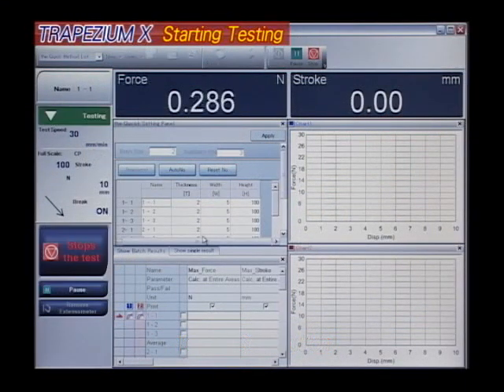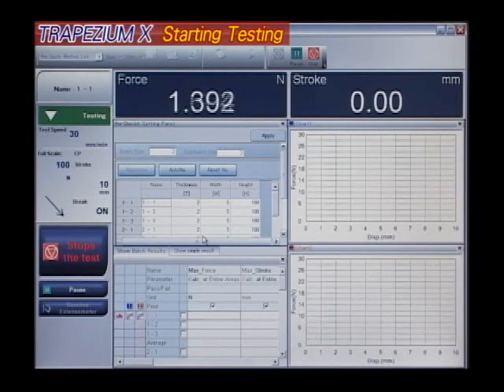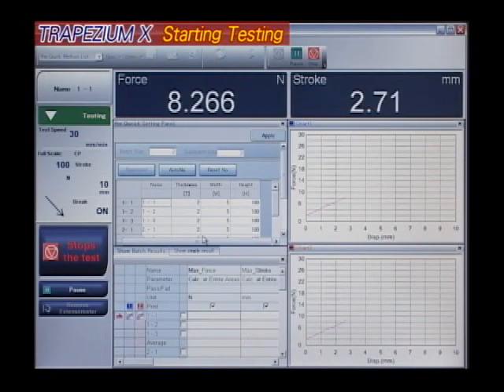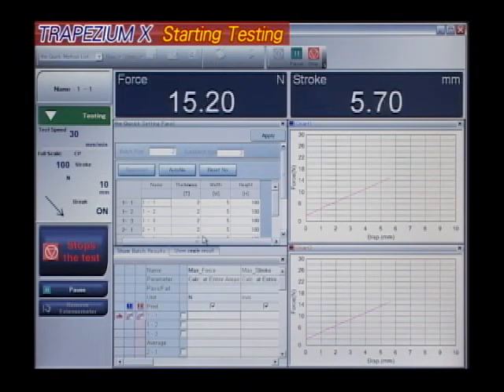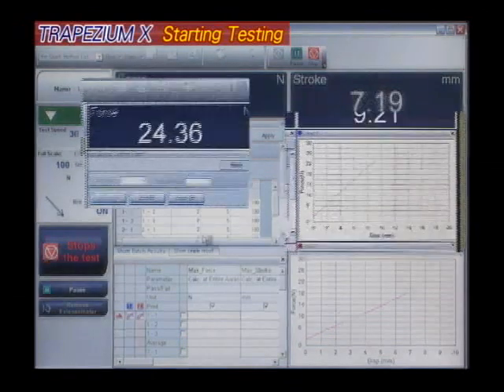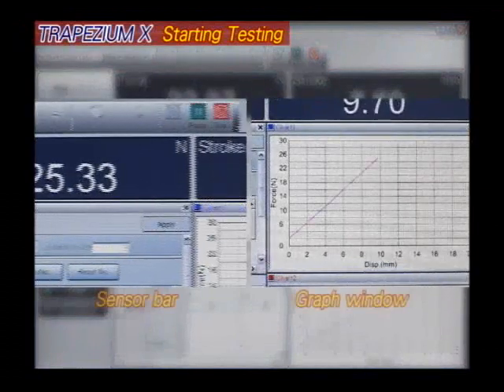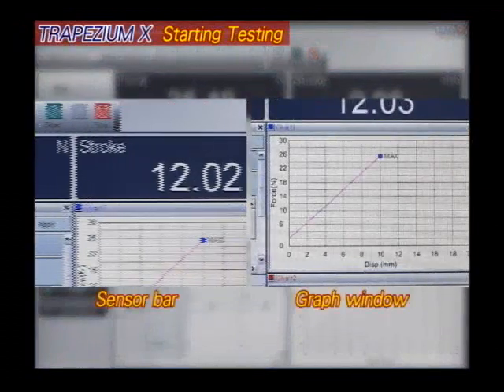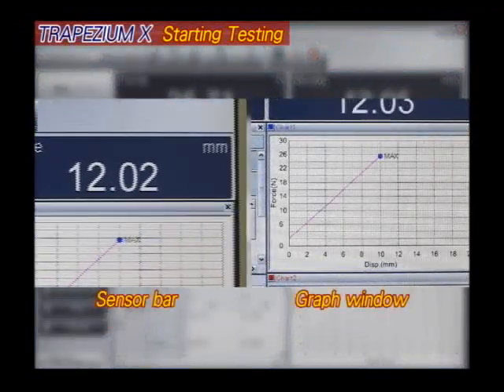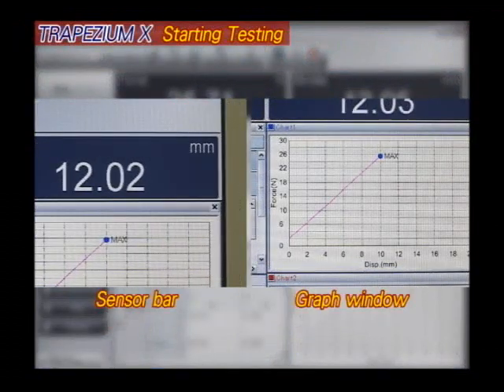After the test starts, progress is displayed on screen. The graph window indicates the testing data, and the sensor bar displays the measurement values in real time.